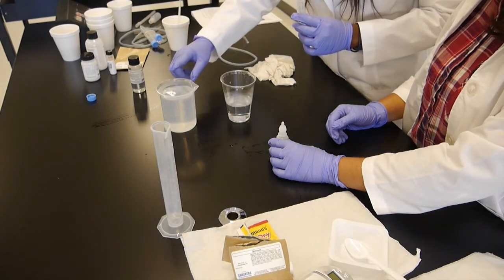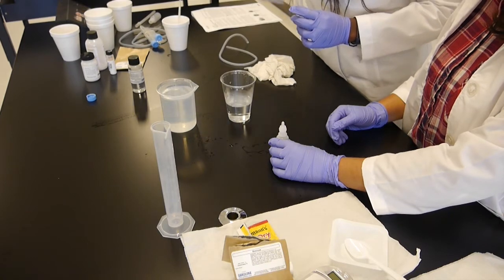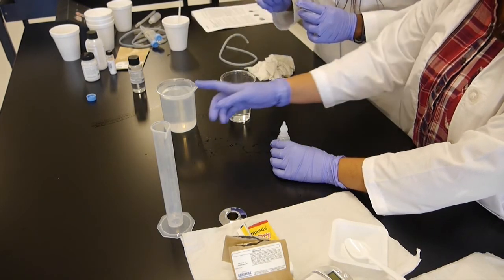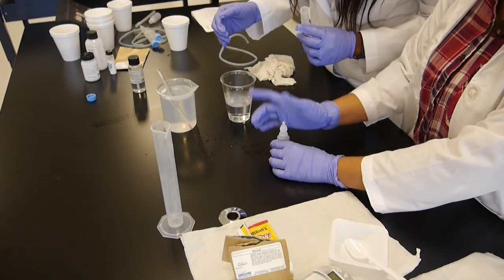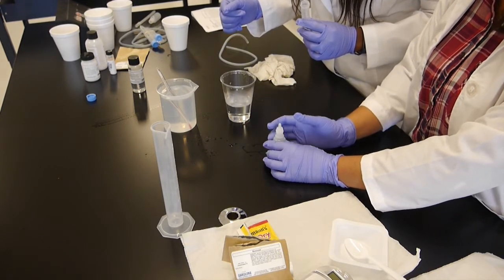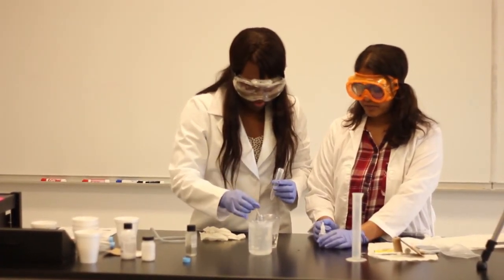Please make sure that your beaker is the one that has the water. So we took out the yeast solution and put it in a styrofoam cup, because this is a lot better to put the warm water in there. Yeah, and make sure it is on 35 degrees Celsius temperature, because the temperature is important. If it's not at 35 degrees Celsius, the reaction won't happen. Right. So it is at 35 degrees. It's at 35, and then you want this one also at 35.